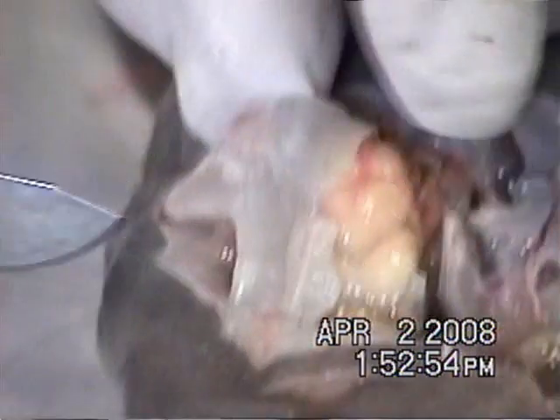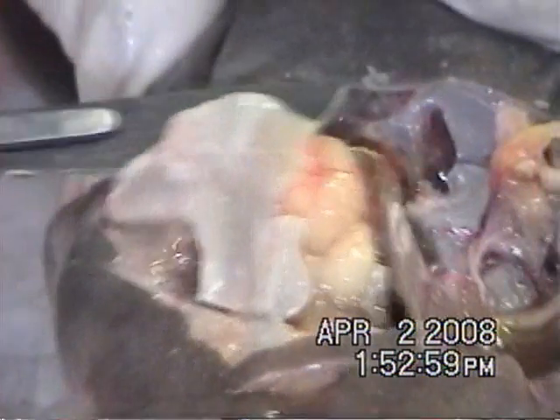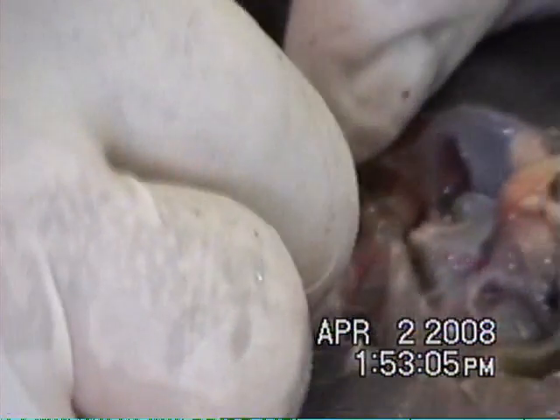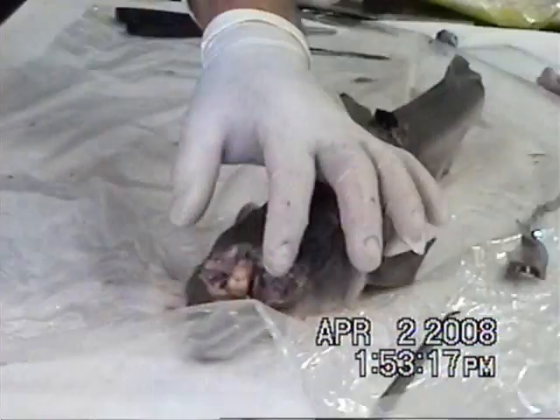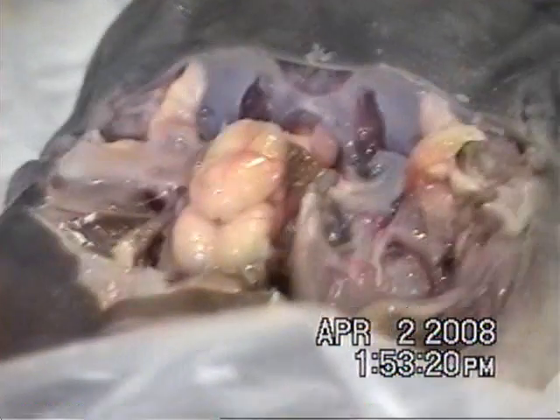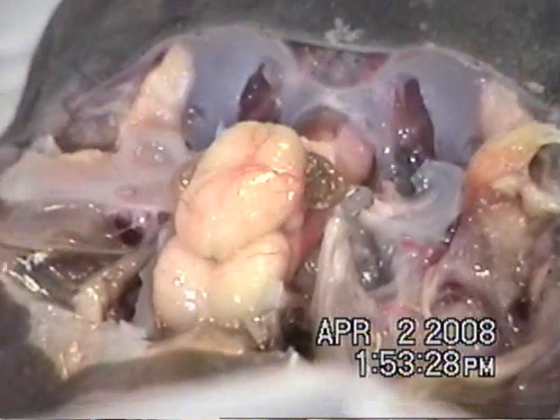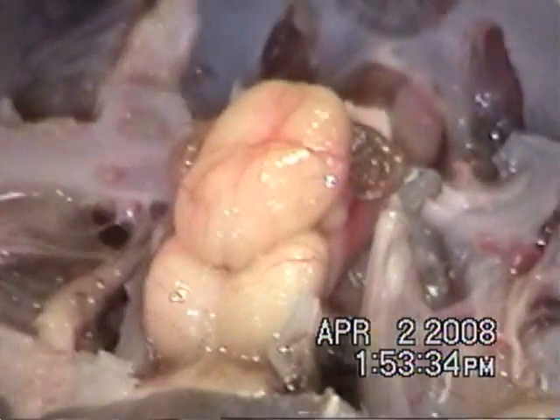If I could get this piece off nicely, we'll be in business. There's the brain. I did a good job. That's so small — you could be a brain surgeon. That is good stuff right there. For sharks — the person would never come out of surgery. Here's a nice little piece of cartilage behind it. That's a small brain.